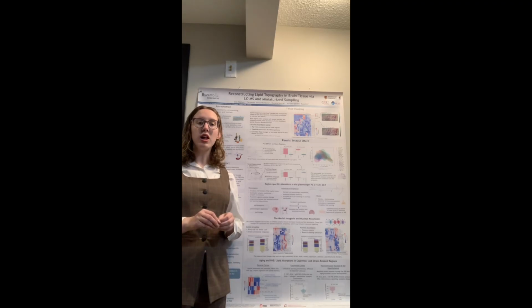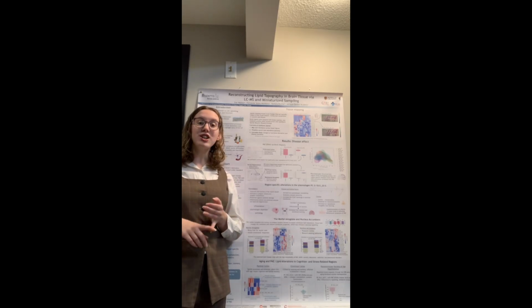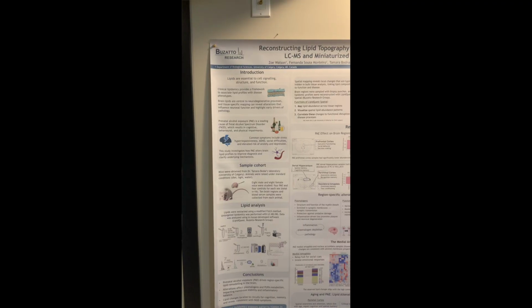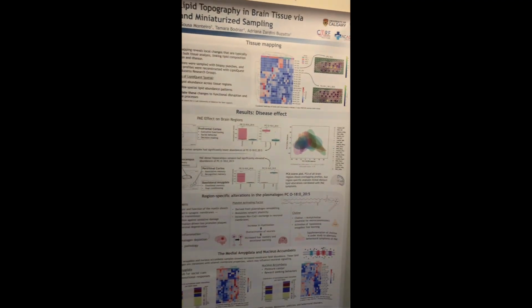Lipids are essential molecules involved in cell signaling, structure, and function, and can be affected by many factors, including age, sex, and diet. For this project, I chose to focus on clinical lipidomics, which aims to connect the classes, structures, and functions of lipids to disease processes.